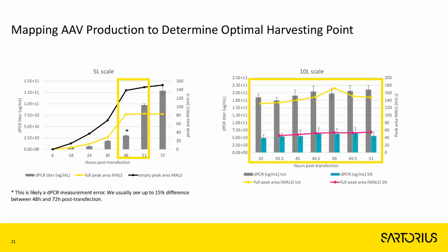Our PCR was, however, giving slightly different data, but having repeated this process a few times, sometimes collecting also different time points, we have noticed that it is more consistent in our experiments that the plateau is truly reached somewhere around 2 days post-transfection.